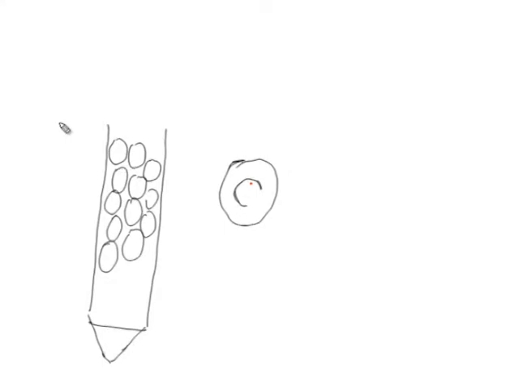And to help you understand porosity, if this is the pore size, then what will happen? A molecule which is bigger than this pore size cannot enter here, but a molecule which is smaller than the pore size can enter into the pores. It can access the inner volume of this bead, which is the trapped solvent or trapped mobile phase, but the larger molecule cannot enter.